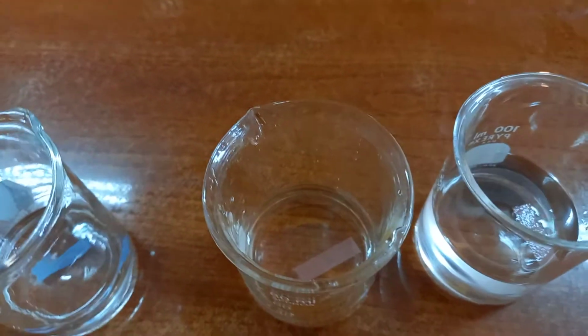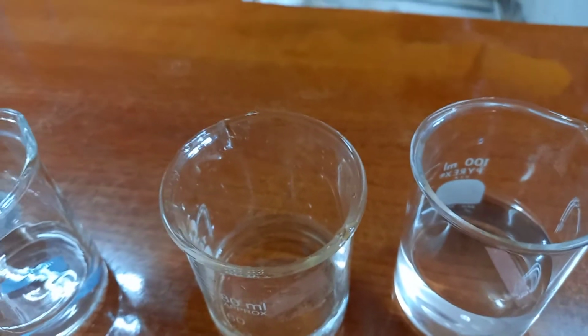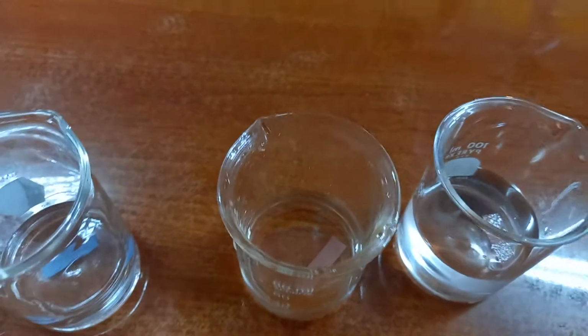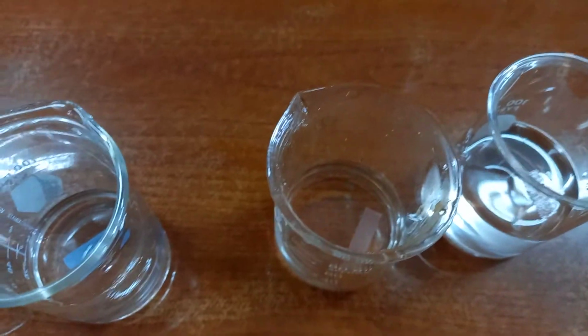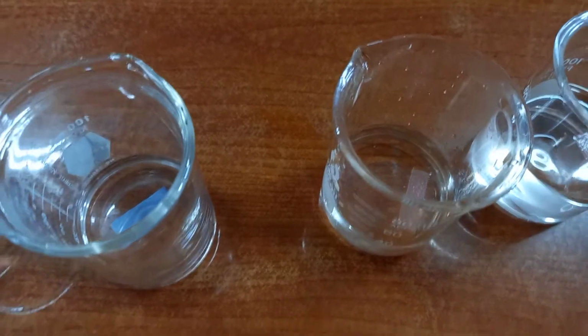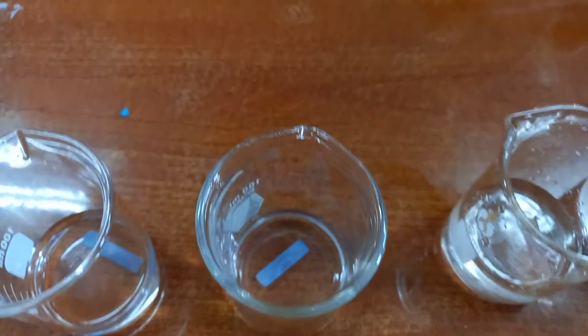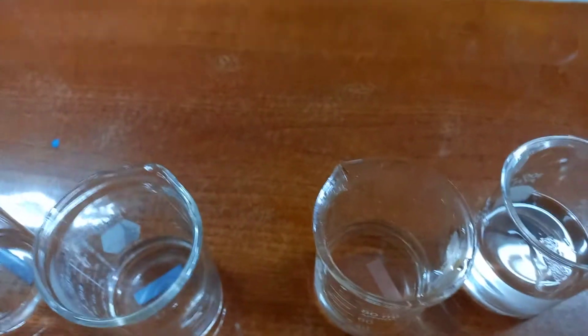So alcohol and ketone blue, aldehyde and the carboxylic acid red. So you can comment and tell me why the aldehyde changes the blue litmus paper to red, but the ketone does not, as well as the alcohol. So carboxylic acid and the aldehyde change it to red. The alcohol and the ketone did not.